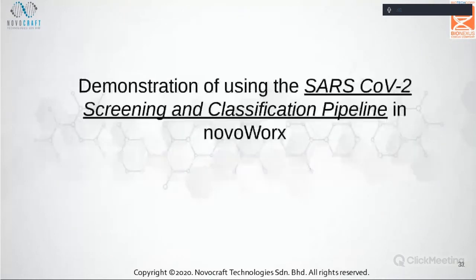Now, we will start the demonstration. In order for us to start novoWorx, just open a tab on your browser.